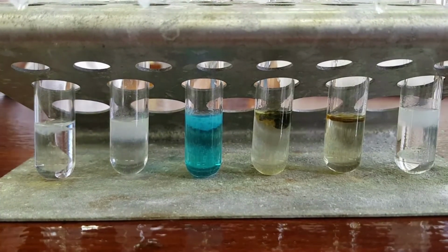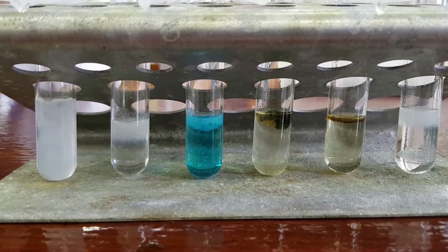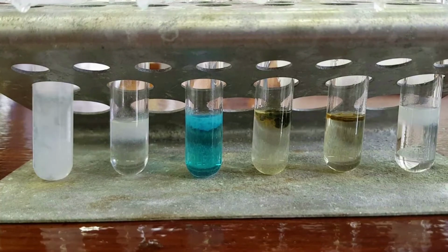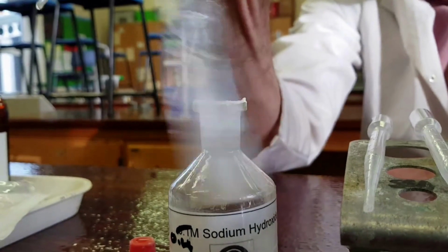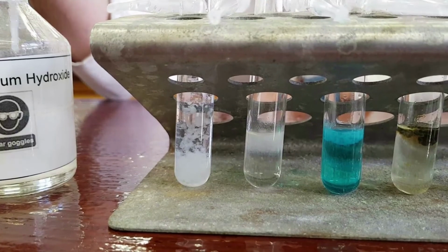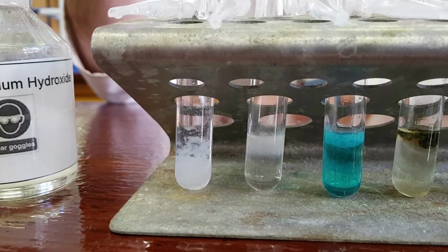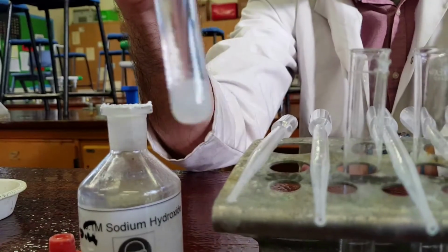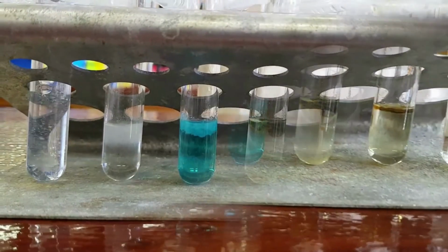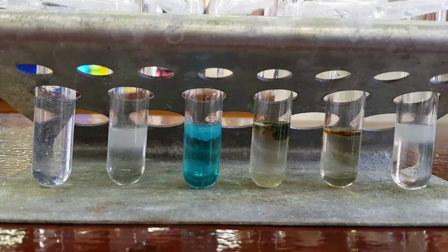What Mr. Reeves is now going to do is put a whole squirt of sodium hydroxide into each of these tubes. First, aluminium. Now, what is happening there, which is quite surprising, is when we added the hydroxide, it initially formed a white precipitate, but as we add more hydroxide, that precipitate is actually starting to redissolve. And we can see the precipitate there has disappeared, or almost disappeared entirely.